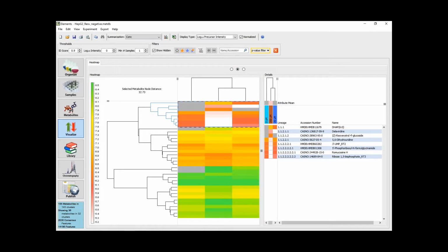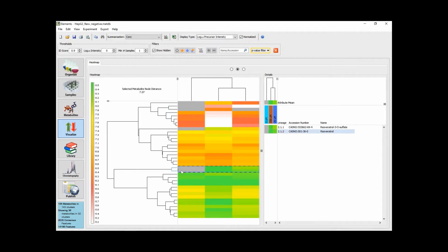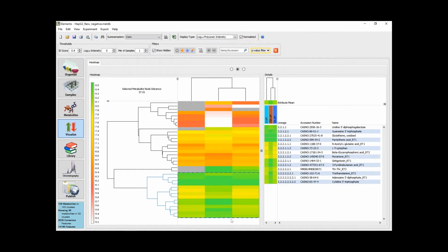And the heat map is really nice in that it shows you which compounds most likely change according to what you expect. So if you look down here, you're going to look at compounds that didn't change at all in 0, and they were up in the next two, and that's the resveratrol compounds we expected. So that makes perfect sense. These next trees over here, even all these trees, are compounds that were in samples, but they didn't look like they changed much at all after normalization in any of these. These are just basic level compounds that were in all these samples.